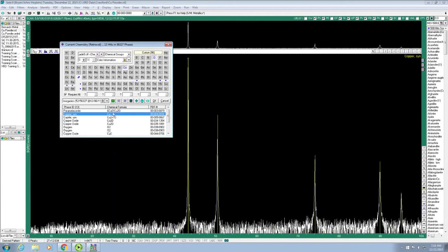formulations. So I'll just go back to the copper, and now I want to mark this as telling the program to hold on to this value. To do so, I'll right-click on this copper formulation, and I select Overlay. By doing that, it pins it to the graph, and now we're ready to go to the next step.